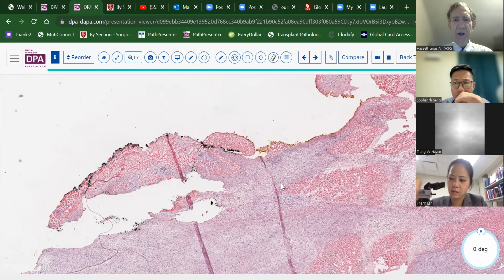So in general, we use a technique of either using a swab or a piece of gauze to paint the surface or blot the surface with the ink, so that it's getting contact with the surface, but it's not being contacted with an excess of liquid.